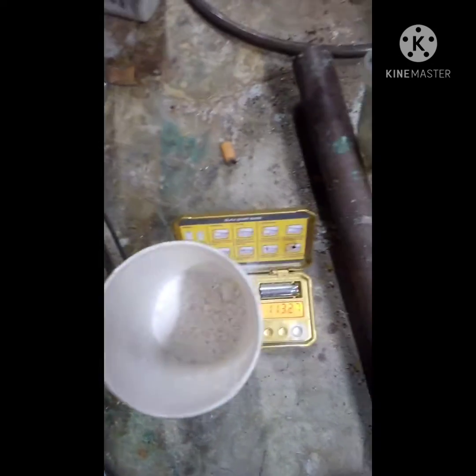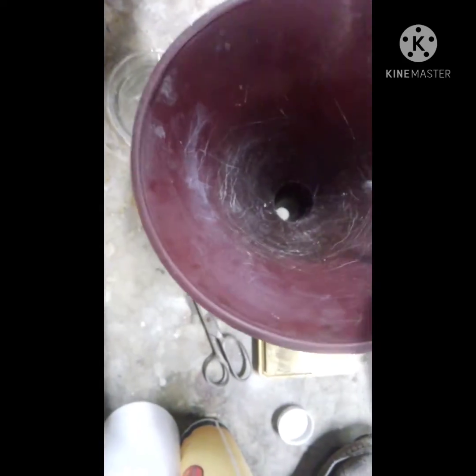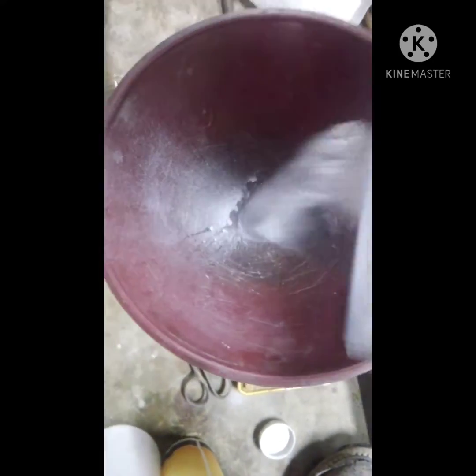Now I'm going to put this back in the blender and blend it again. Straight out of the blender and into the container — and it literally is that simple to make Silica Gel G.